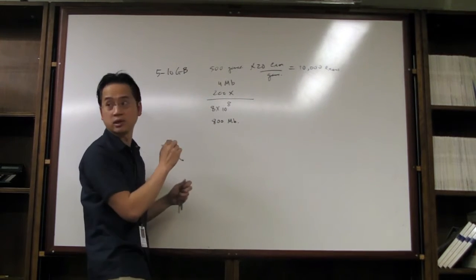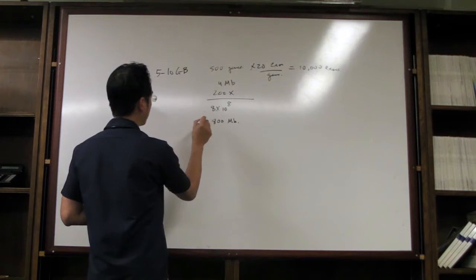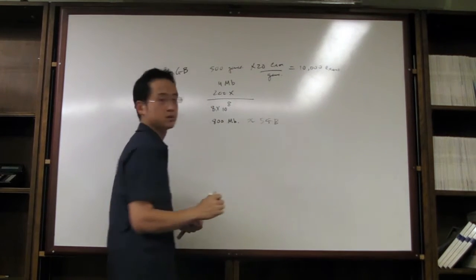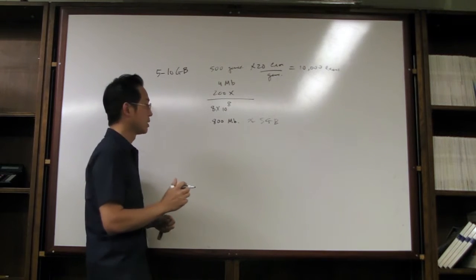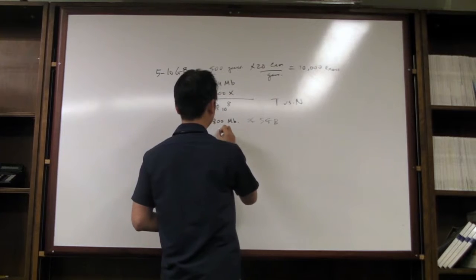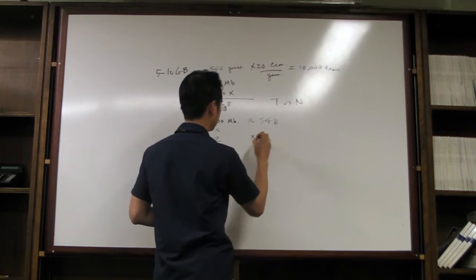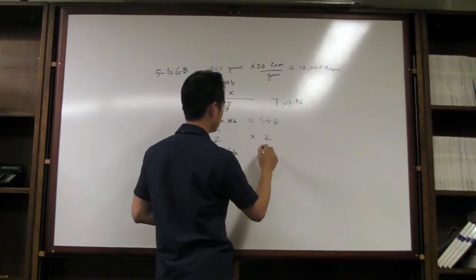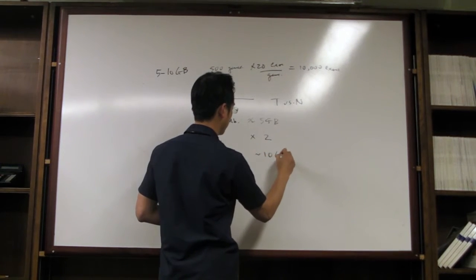I'm just throwing some numbers out. So this part will be maybe on the lower end, about roughly 5 gigabytes of data. And if you do a tumor versus normal, you would want to double all of this, right? Times 2 times 2. And this would be 1.6 gigabases of information, roughly 10 gigabytes of information.